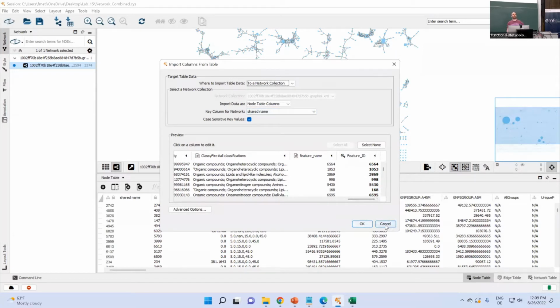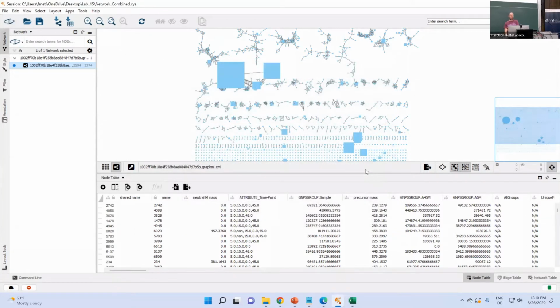Okay. Frank? Yeah. So if Canopus was now finished successfully... Yeah. Just for a test, if Sirius stopped in the middle and only processed half of it, you can write the summaries anyway, and then it will just write it up to the feature where it got to, right? Obviously, if this is an important data set, you want to make sure that all the features went through. But for test purposes, feel free to do it also with the partial thing.